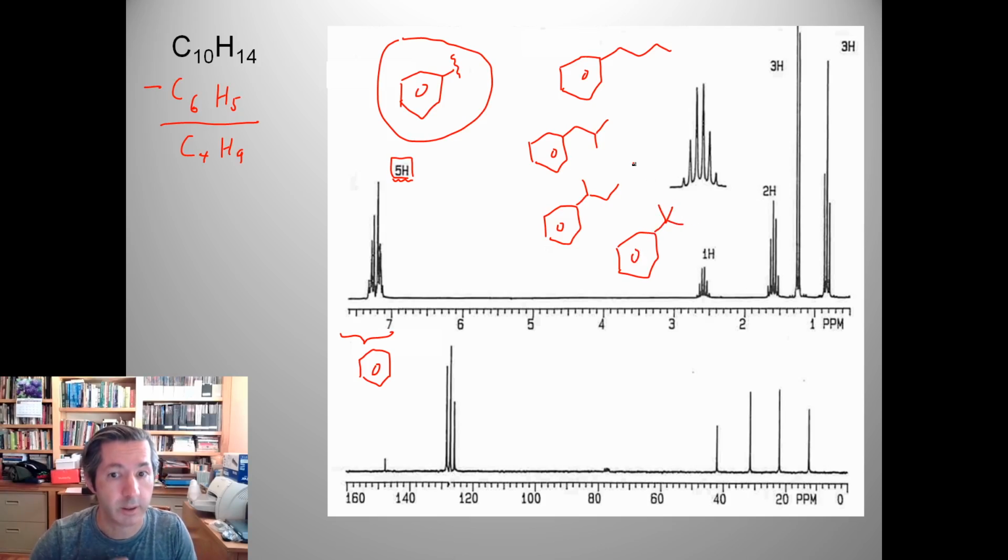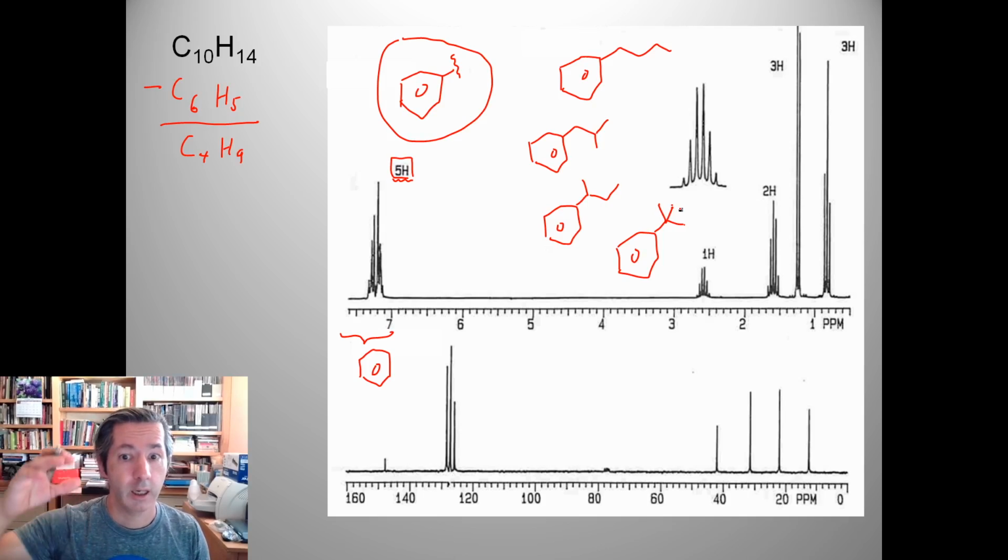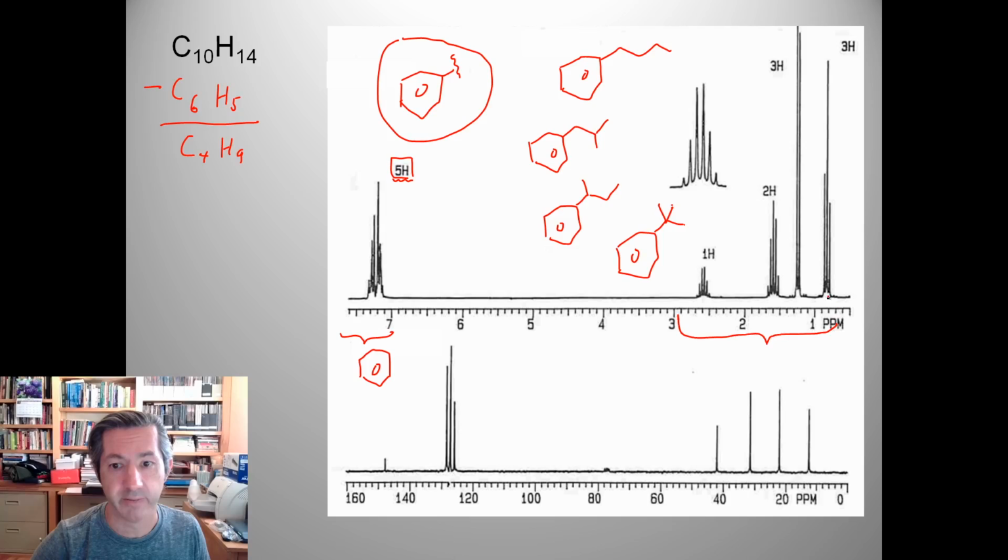And watch what we can do with these right away. We look at the t-butyl group. Every one of these CH3s is in the same environment. The dead giveaway of a t-butyl group is that you tend to have a giant, actually a ginormous signal that isn't split, that integrates for 9 hydrogens. We do not have that here. We've got 4 different signals. I have to cross this out.